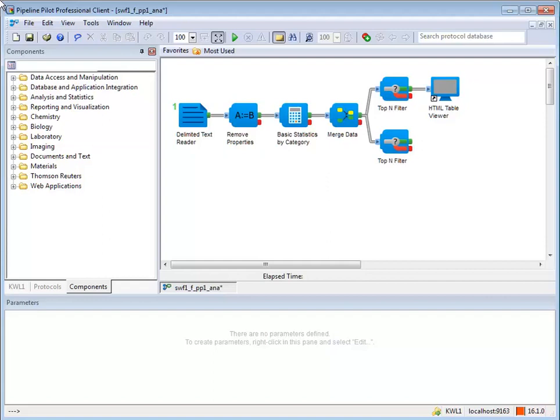Component information can be reused by cutting or copying and pasting components within an existing protocol. The standard Windows keyboard shortcuts can be used to do this.